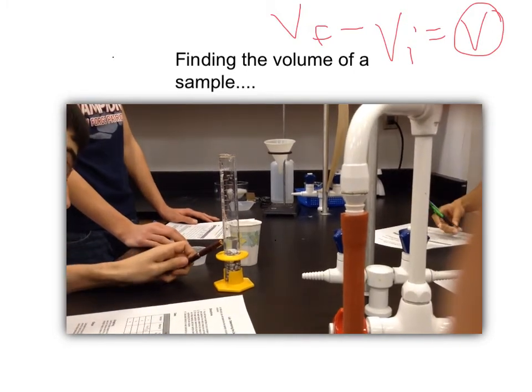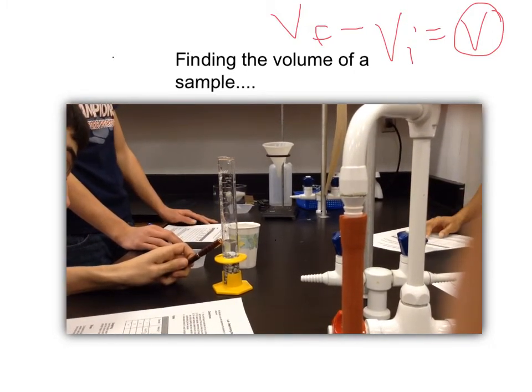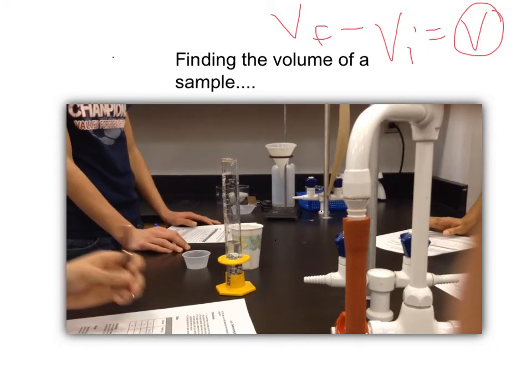We take the final reading, and then to figure out the volume of the sample, final minus initial.